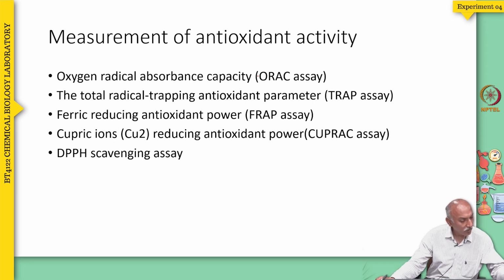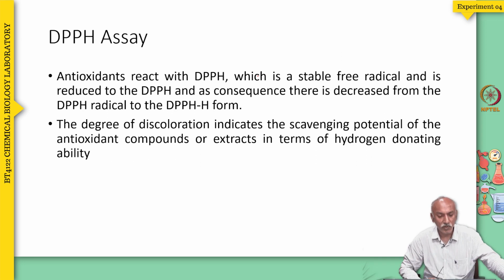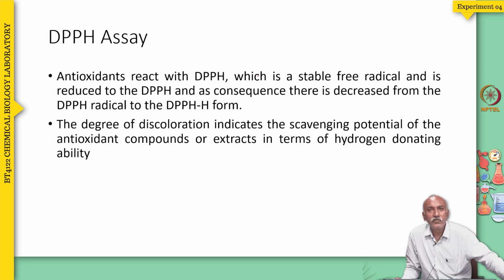Okay, so DPPH is nothing but diphenyl 1-picrylhydrazyl. That is the compound, diphenyl 1-picrylhydrazyl, and that is the assay we are planning to do for this one. And how does the assay work?